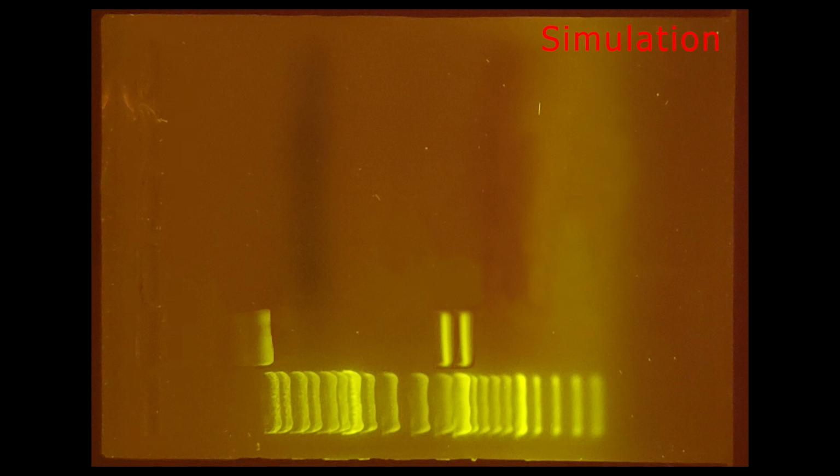When done, our gel should look like this. Note that the wells are on the left side. Now you can use the DNA ladder to estimate the size of your bands and confirm or deny the presence of your plasmid.